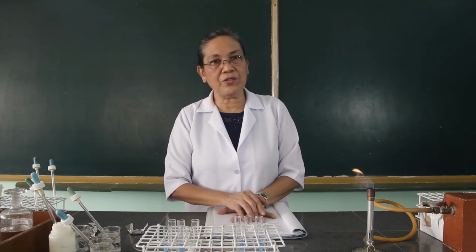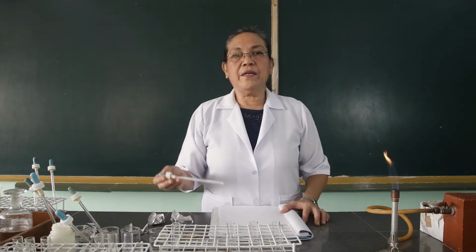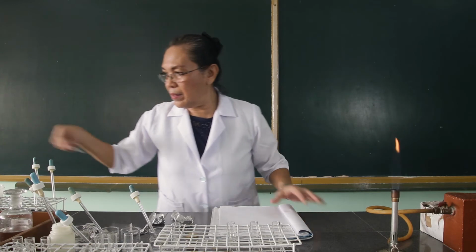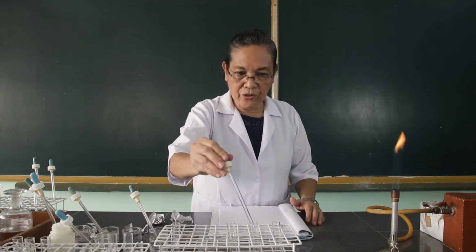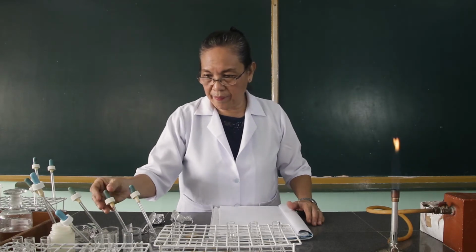The next procedure is we're going to add to the different ions barium, magnesium, calcium, and strontium 4 drops of potassium chromate solution. And I want you to observe. So let's get 1 ml of these solutions. This is barium chloride. This is calcium chloride. And this is strontium chloride.